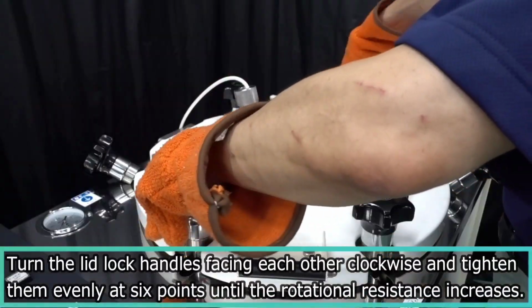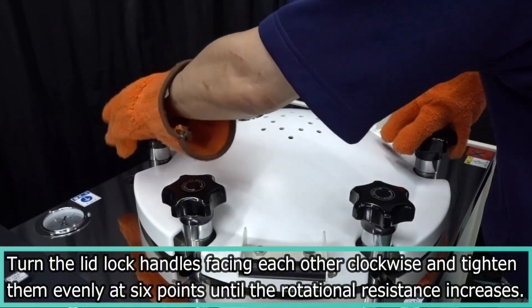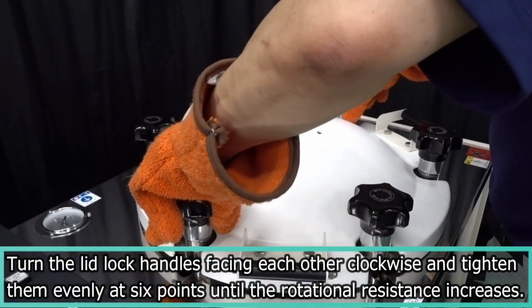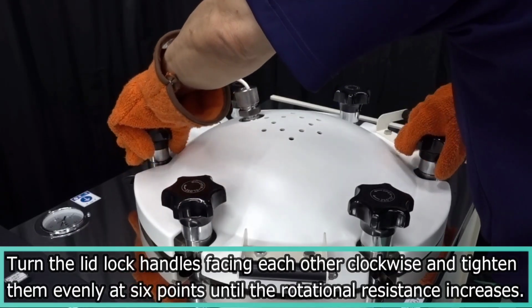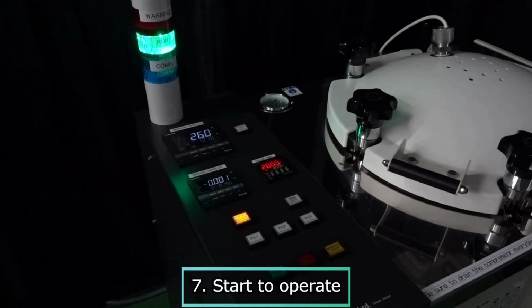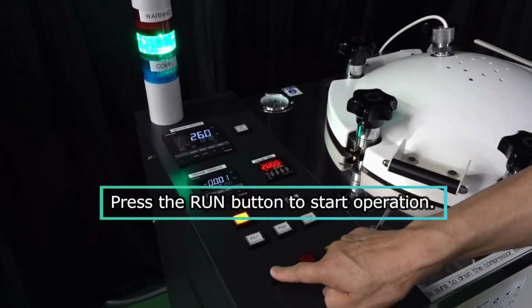Turn the lid lock handles facing each other clockwise and tighten them evenly at 6 points until the rotational resistance increases. Start to operate. Press the run button to start operation.